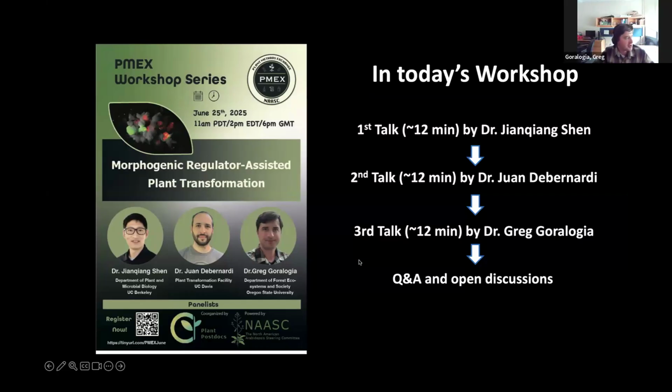Yeah, so we've done some testing. Originally, the whole point was for me to try and do it in Golden Gate, and I had to make some cloning compromises with the orientation. Especially, these are big regions, so 10 kb, you're going to have like 20 BsaI sites, right? So a lot of mutagenesis. Putting the 6B gene next to the left border where it might get truncated for sure reduces the activity.